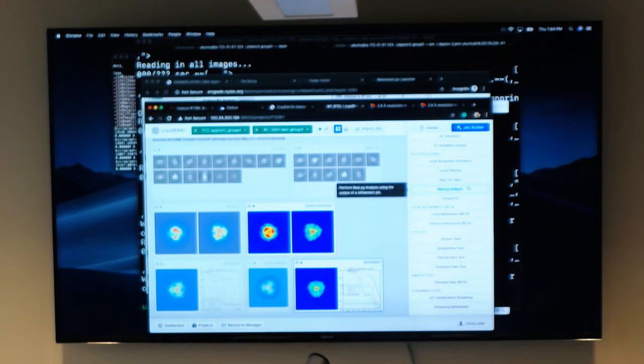ResLog analysis is something that may also be useful. Let's say you have a target resolution. What this will do is reconstructions in different subsets. Like, if I had 1,000 particles, what's that resolution? 2,000, 3,000, 6,000, etc. Then you could extrapolate: if I added more particles, would I improve resolution? If you're plateaued, let's say I'm at 4, and I'm at my particular slope, and now if I want to get to 3, I need 500 billion particles, then you would understand you're probably plateauing.